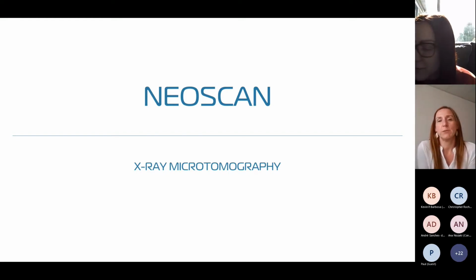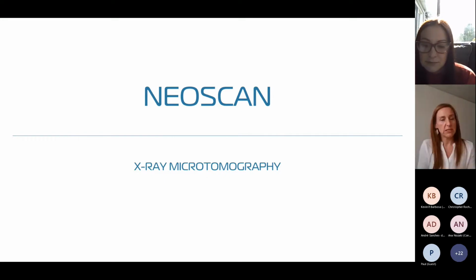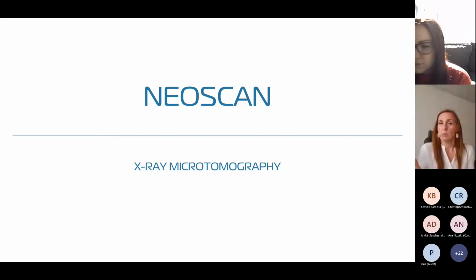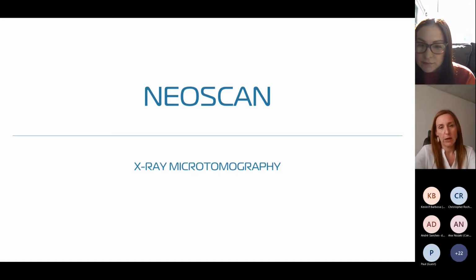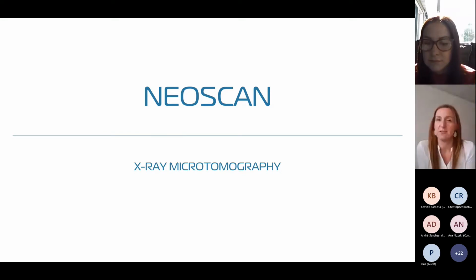Unfortunately, no, analysis software is not included in the software which comes with our systems. Currently we only supply whatever is needed for the instrument: the instrument quality, the acquisition, the high quality reconstruction, and afterwards visualization to evaluate whether you really targeted the highest quality in the scan. For analysis, we typically try to make a recommendation depending on the application, and we collaborate with third-party packages. Our data is also compatible with all the software which you are currently using.